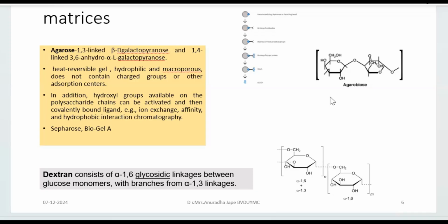Of course, silica, that we talked about in detail in the previous lectures with respect to TLC, could also be a good column material. The silanol groups, SiOH groups, make it hydrophilic, and these OH groups are going to be the adsorption sites, and further it can be derivatized also.